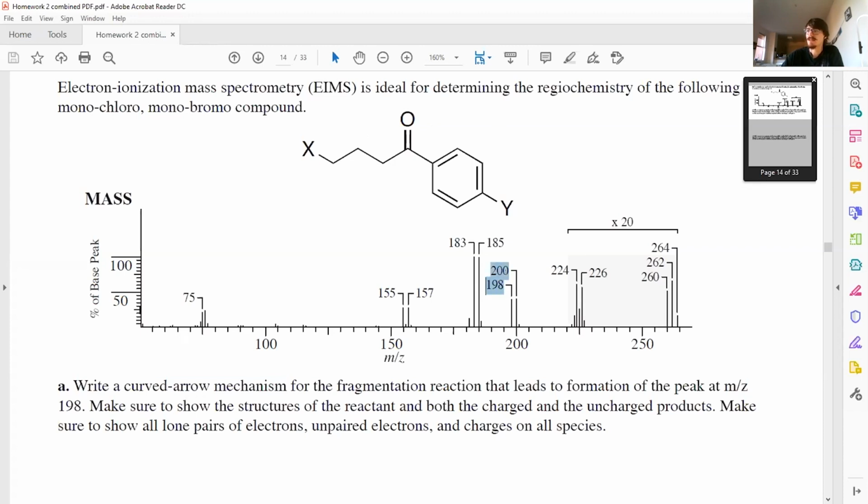You can tell from the isotope pattern of this 198 to 200 fragment, like Franco mentioned, that because it is 1-to-1, that fragment is the bromine containing fragment. If you know that at the end of a McLafferty rearrangement you're left with the acylium ion, then there are two ways to go about it, because the 198 mass is also consistent with loss of chlorine, CH2, CH2, CH2, or maybe H1 because that one's abstracted.